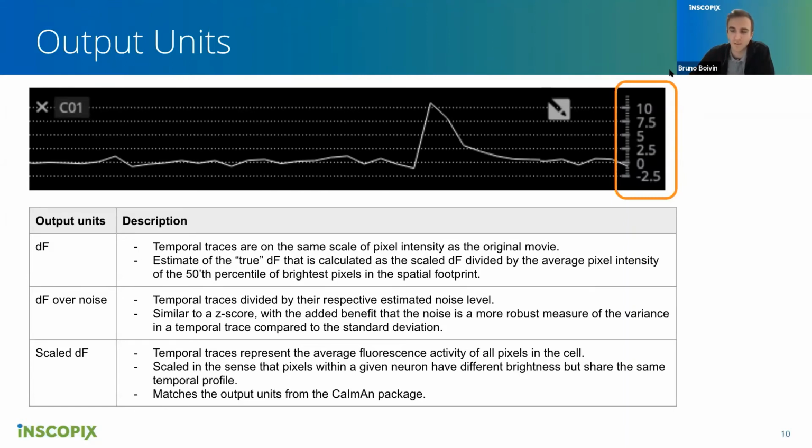So even if you have 30 seconds, you'll be able to run CNMFE. It's just that if you have more frames, it's more likely to give you a better output. It's still going to do the job, it just might be worse. Also, if some neurons are only active later than 30 seconds, then you wouldn't identify them, because it's looking for active regions in your field of view. Sure. Thank you.